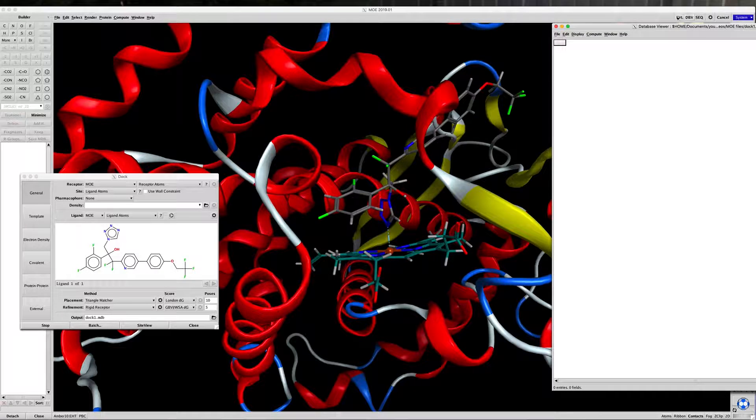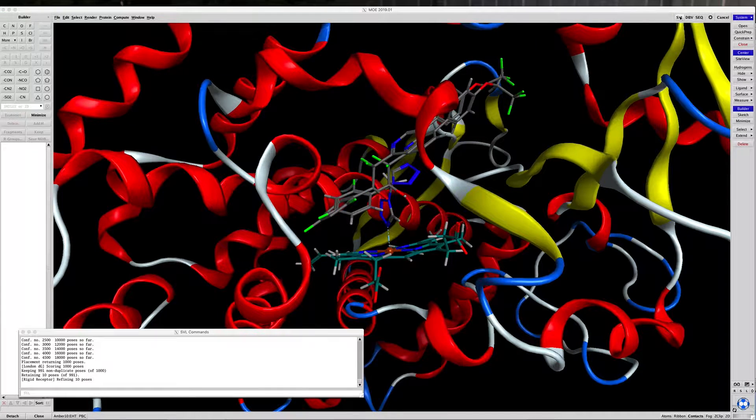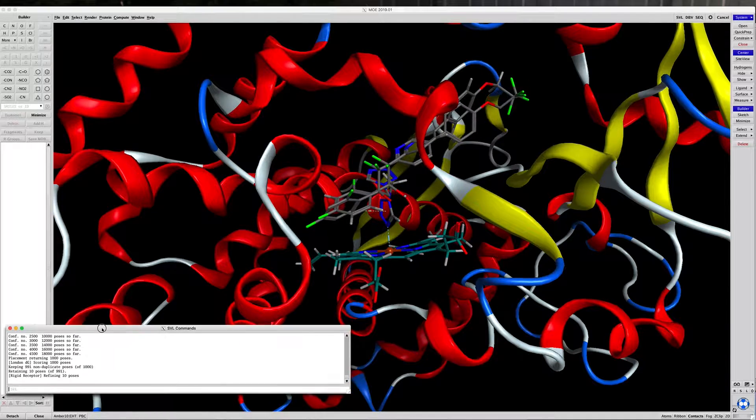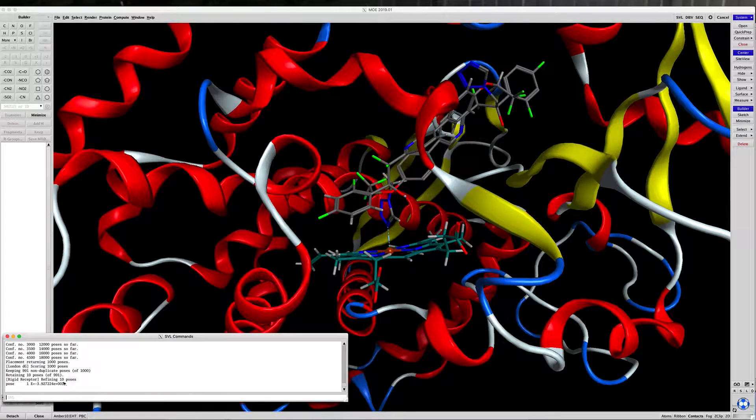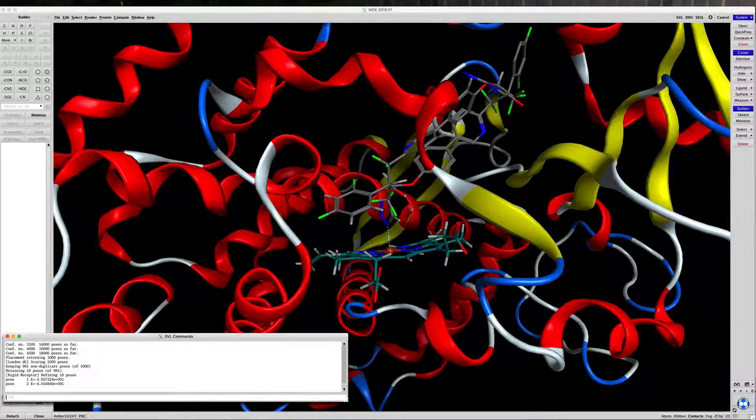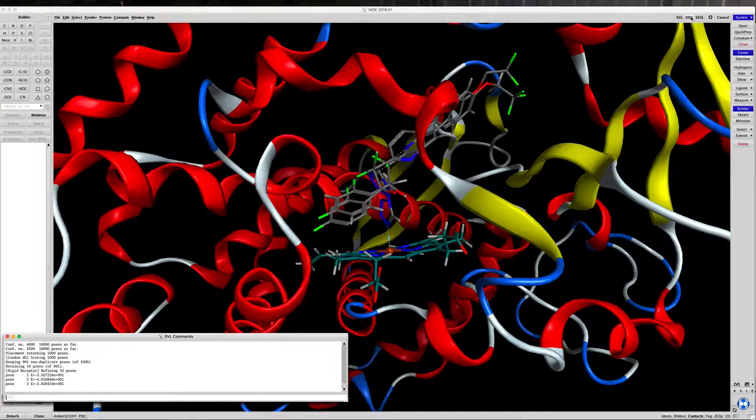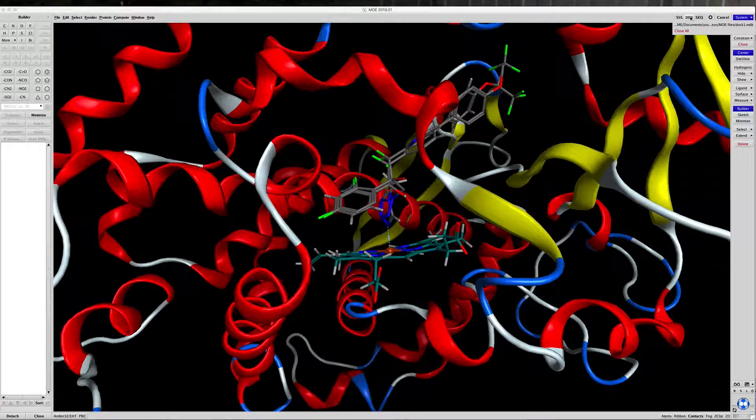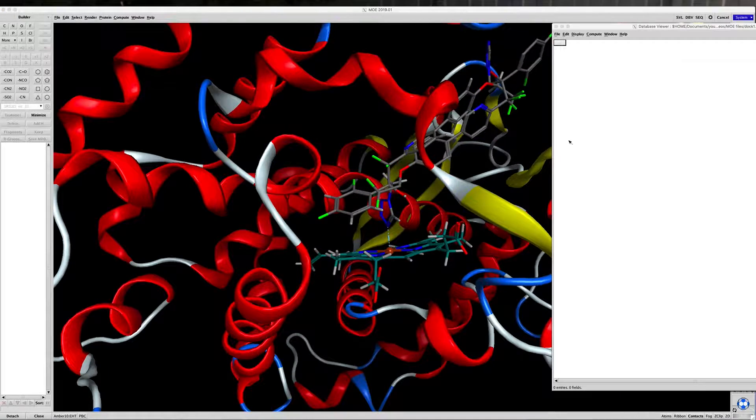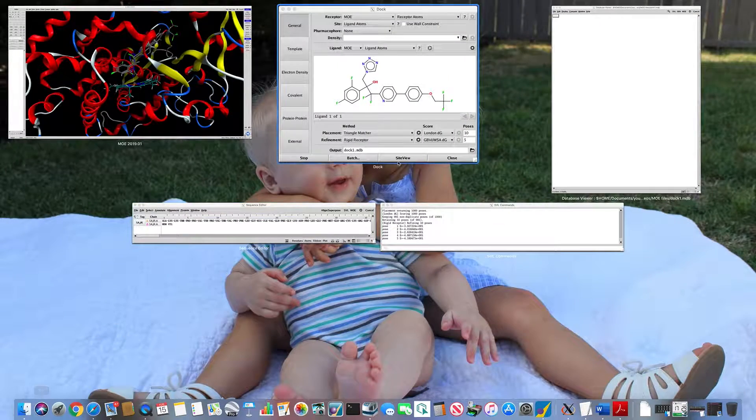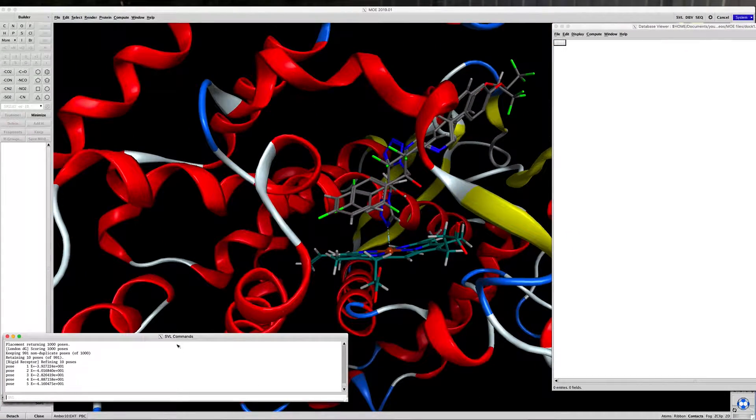A Database Viewer window opens up, and this will be where the output will show up. If we click on the SVL window, this tells you what's going on with the software. Click on the DBV, that's Database Viewer window, and we can find the SVL, so we can look at both.